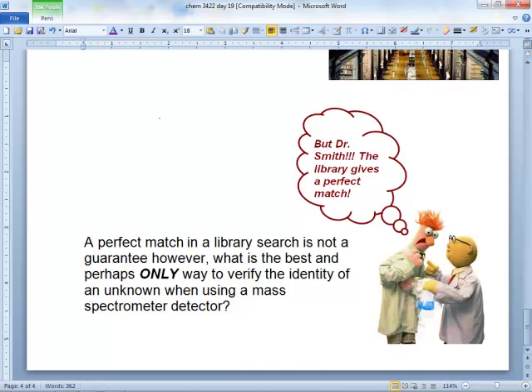It tells you what to test. Say it was ethanol. He was drunk. Just shoot the ethanol and verify it. Okay. Right? You have to shoot the pure ethanol. You know its retention time, its mass spectrum. Compare it with what was in the guy's blood. Match. You're done. Can't argue with it. Okay.